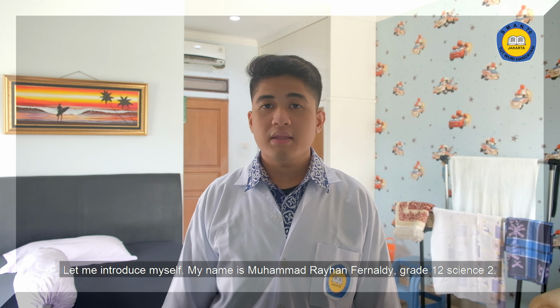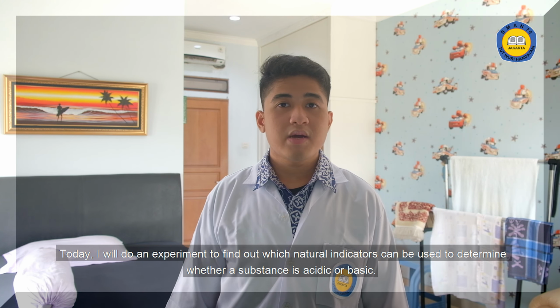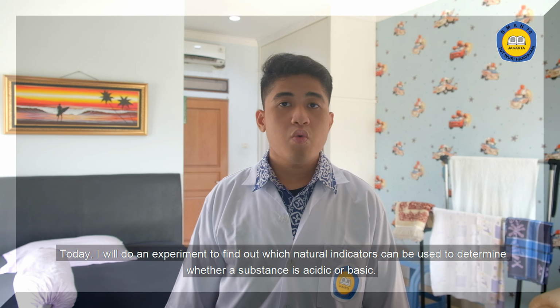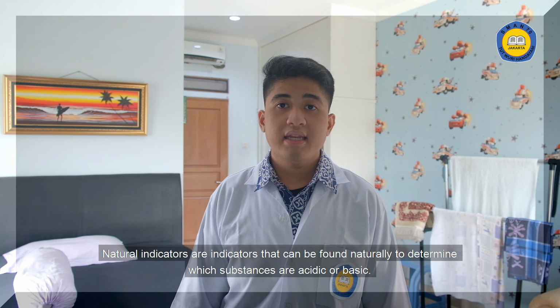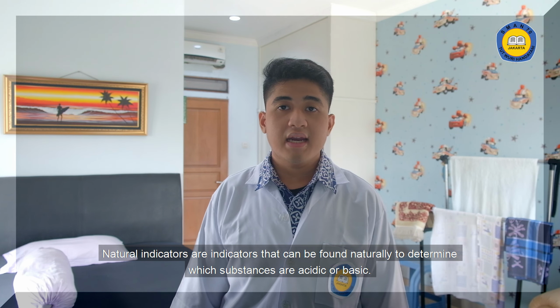My name is Muhammad Rayhan Fernaldy, grade 12 Science 2. Today I will do an experiment to find out which natural indicators can be used to determine whether a substance is acidic or basic. Natural indicators are indicators that can be found naturally to determine which substances are acidic or basic.